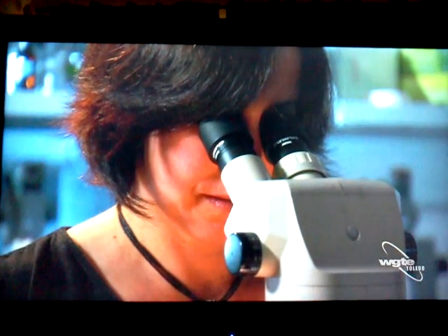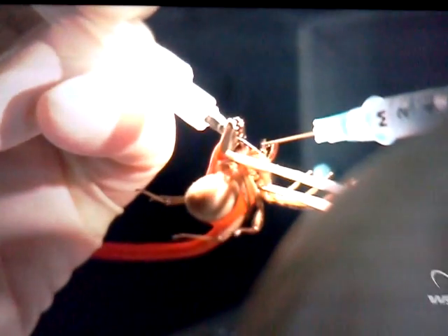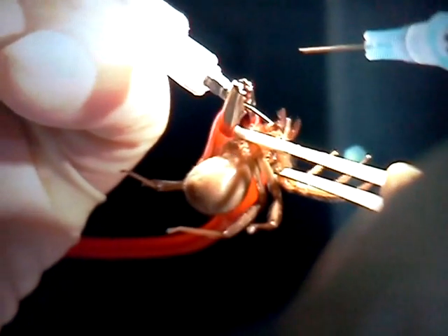Sounds kind of medieval. Right now I'm rinsing her fangs, because sometimes I have little bits of things, and we want a pure venom sample.